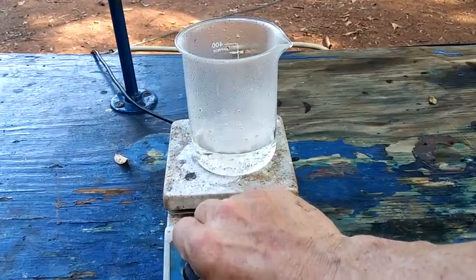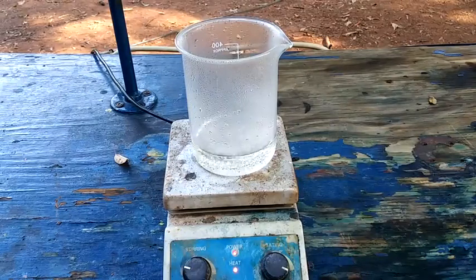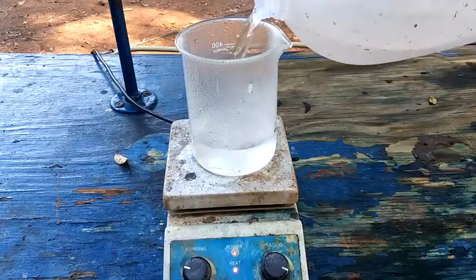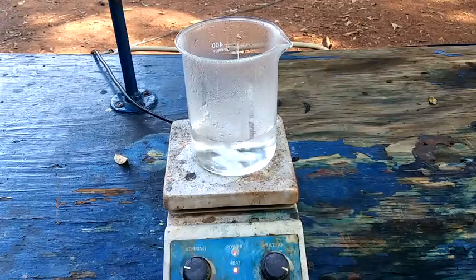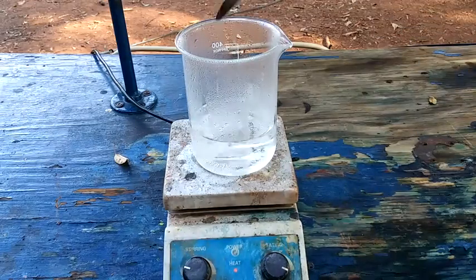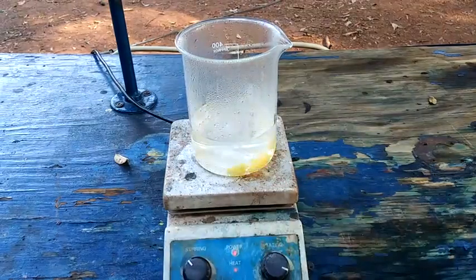Alright, let's see. At this point, I'm going to turn on stirring here. I'm going to dilute this a little bit with some distilled water. And here we go. See, it forms the oxide very quickly.